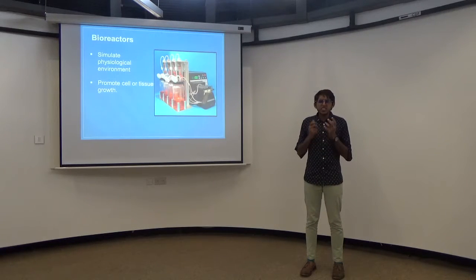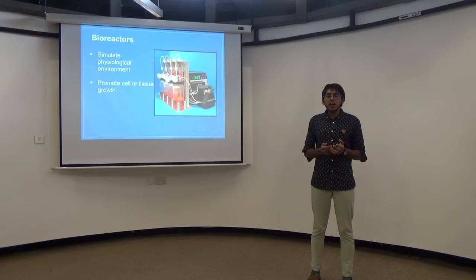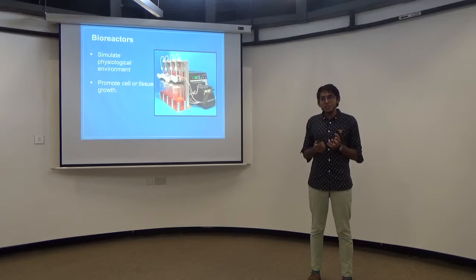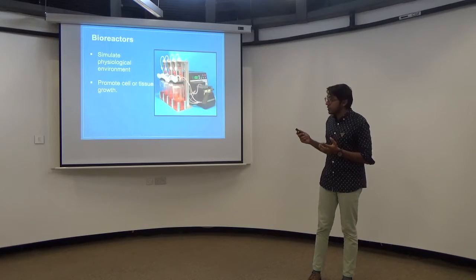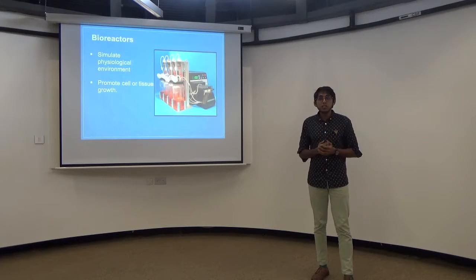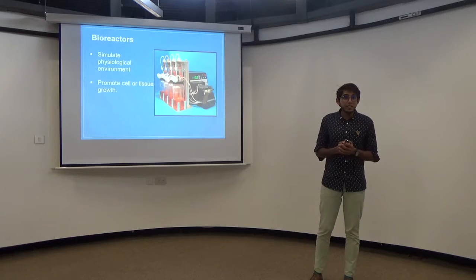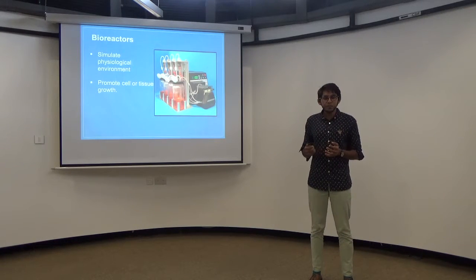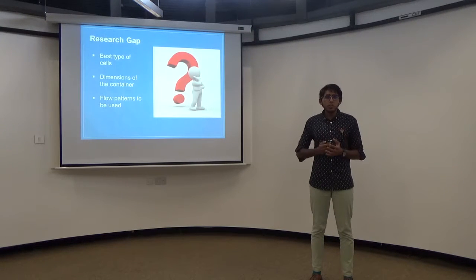So bioreactors are extremely crucial in tissue engineering. They are used to simulate the physiological environment for cell culture, and they are needed to promote the growth of cell cultures. My project will be focusing on bioreactors, and to be more specific, I will be focusing on perfusion bioreactor, which is the most sophisticated bioreactor in the industry.